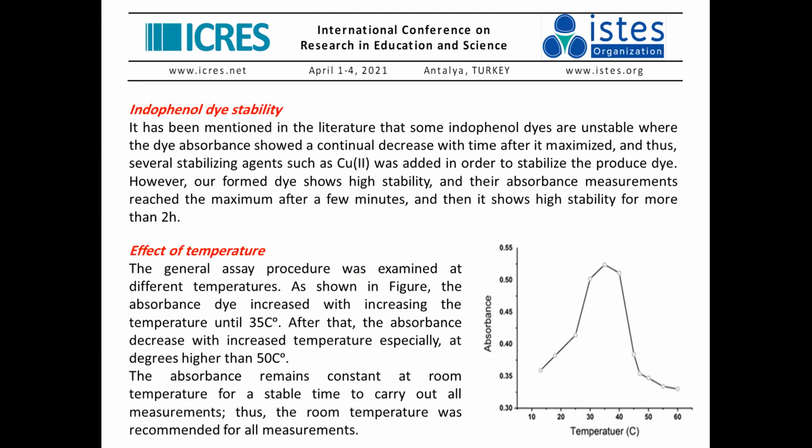You have to study some parameters. One of these parameters is the indophenol dye stability. Most of the literature mentions that the absorbance of the indophenol dye is unstable.